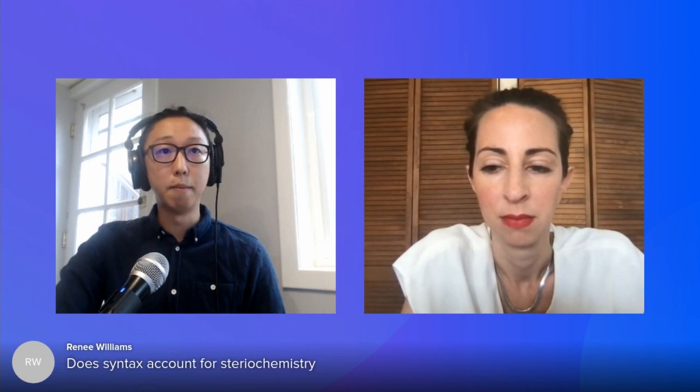I'm going to hop to continue with Renee's questions down. Does the syntax account for stereochemistry? Yeah. Within our monomer library, we take in a chemical structure representation of that particular monomer. And so we do have an ability to make monomers stereochemistry aware. It's just really going to be up to the customer, the user, to provide the stereochemistry-aware either mol file or canonical SMILES string that represents that.